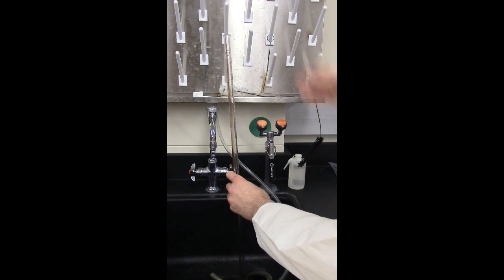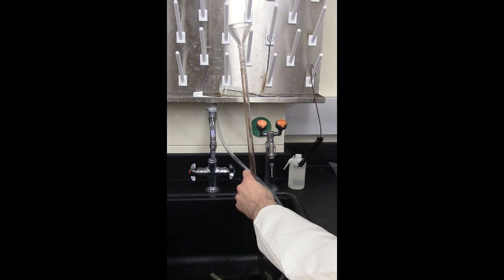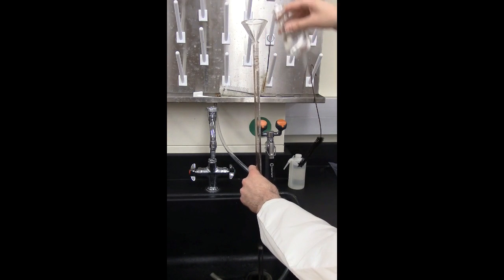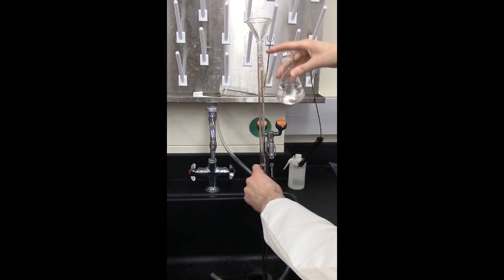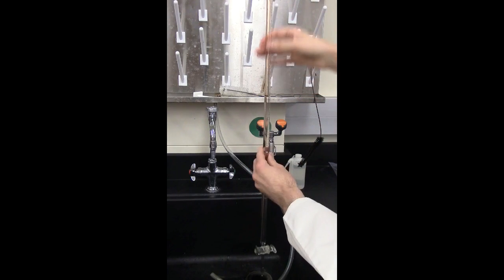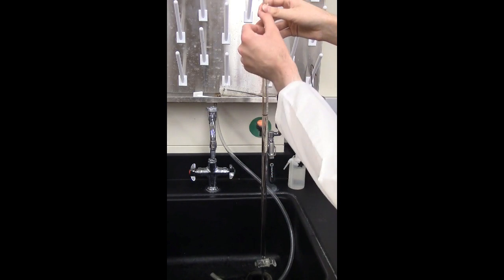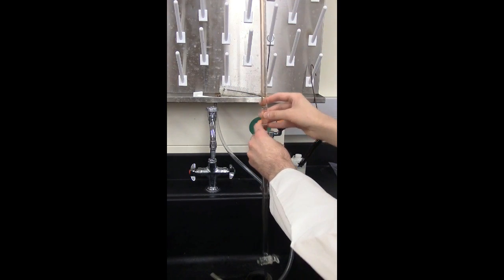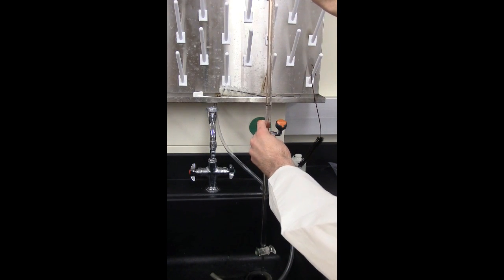What we want to do is, just like before, put a funnel at the top of it and pour it in slowly and carefully. You'll notice at the top that some liquid is still in the funnel as you're pouring it. So make sure the water level, or the level of the substance, doesn't get too high up to the top before you stop pouring it in, because you'll have a little bit more liquid go into it that's still in the funnel.